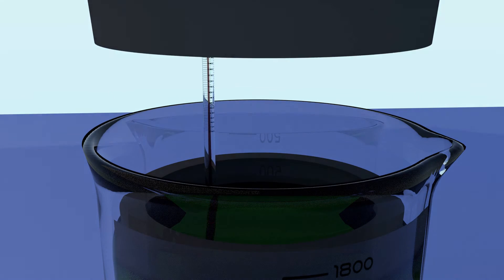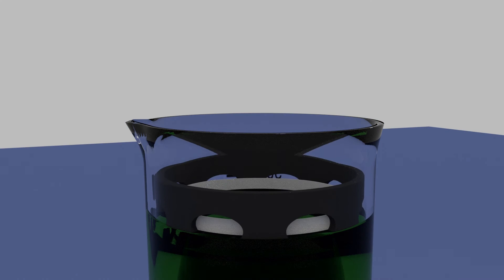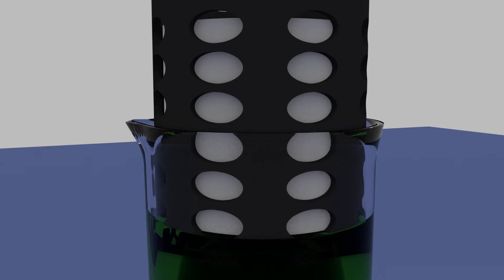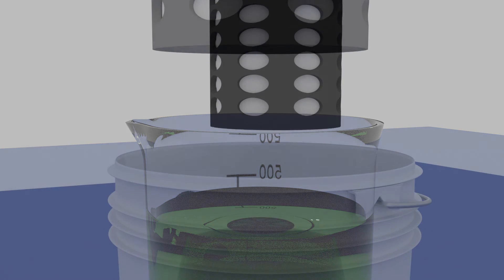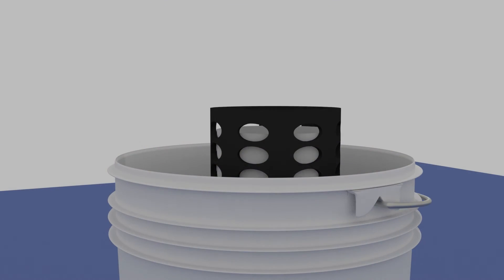Remove the cap. Slowly lift out the basket with filter pouch, allowing it to drain. You can rest the basket in a bucket or any other plastic or glass receptacle.